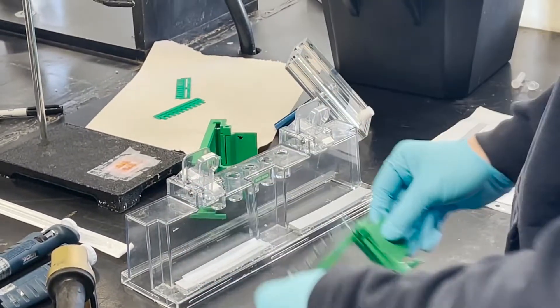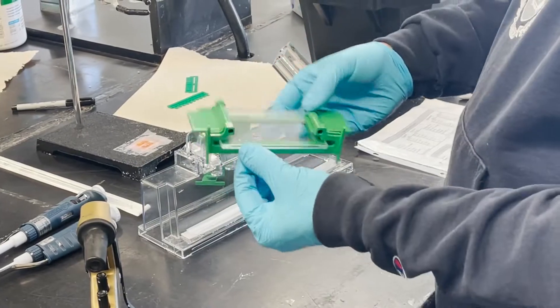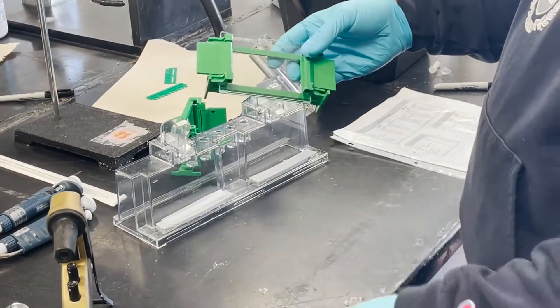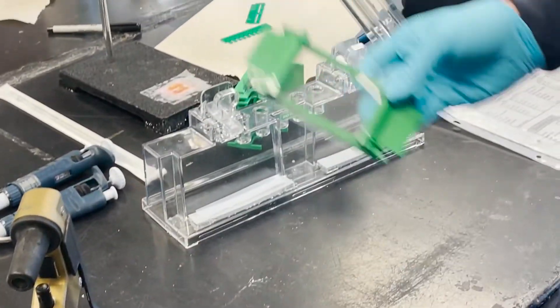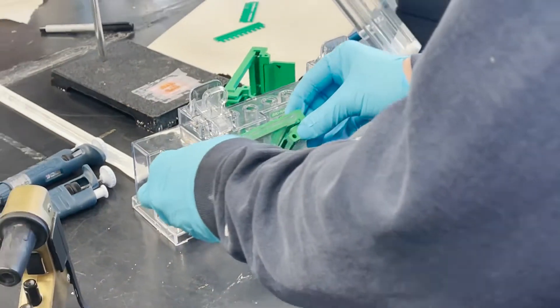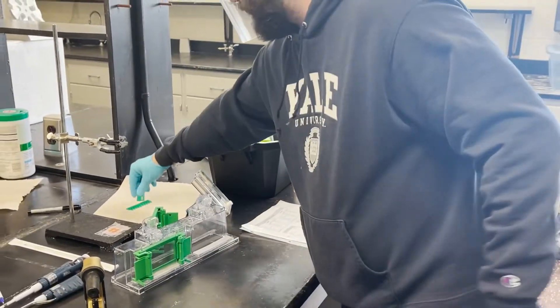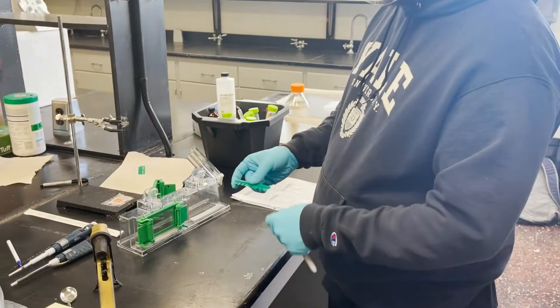Now the sides are sealed. One of the problems with pouring gels — the most common problem — is that they leak out the bottom before they polymerize. One solution is to have some parafilm, and there's a second solution I'll show you. Once you have the system set up, you need to know how much gel you actually need to pour.